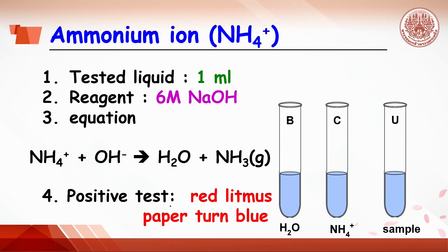The last ion to be tested is ammonium ion. It reacts with hydroxide from sodium hydroxide to get the ammonia gas, which turns the red litmus paper to blue.